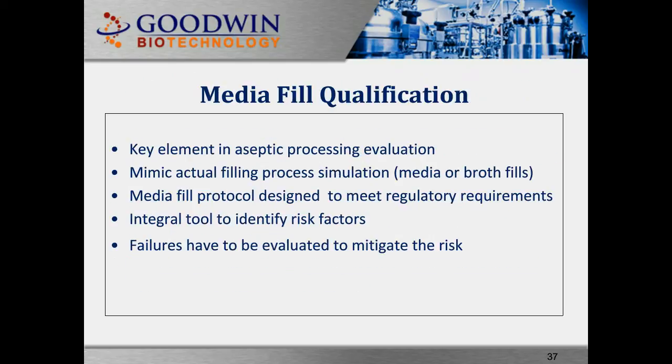Media fill. What is media fill? Media fill is the performance of an aseptic manufacturing procedure using a sterile microbiological growth medium in place of the drug solution to test, qualify, or confirm whether the aseptic procedures are adequate to prevent contamination during actual drug production.